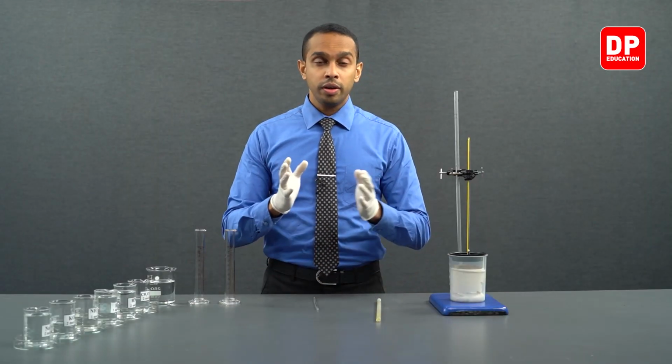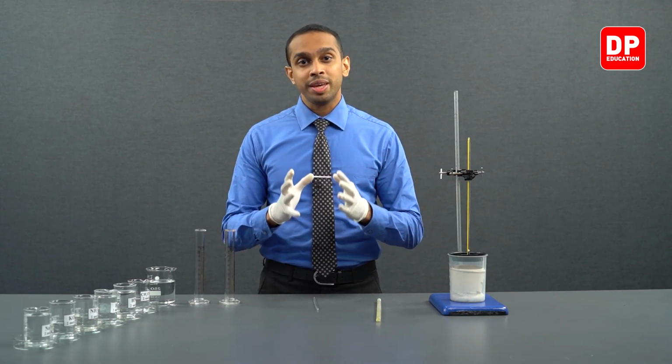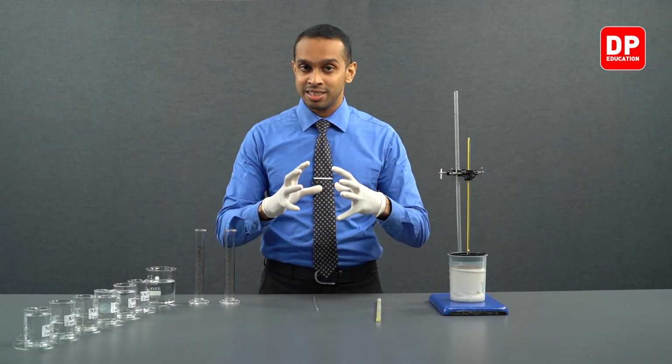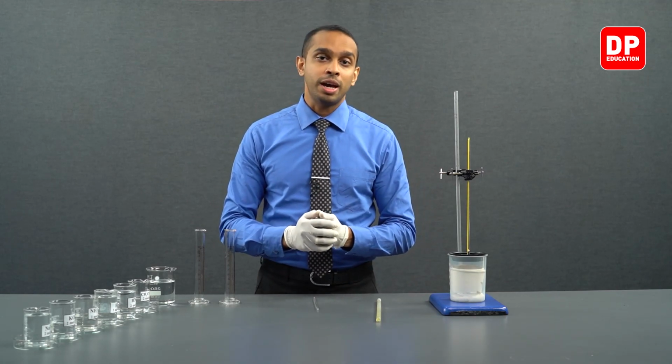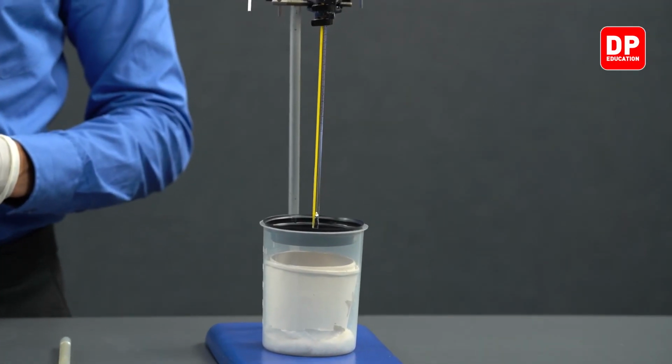And when the reaction is taking place, we need to make sure that all of the heat that is flowing into the system or out of the system is contained within the system. So therefore, we are using a heat insulated setup.